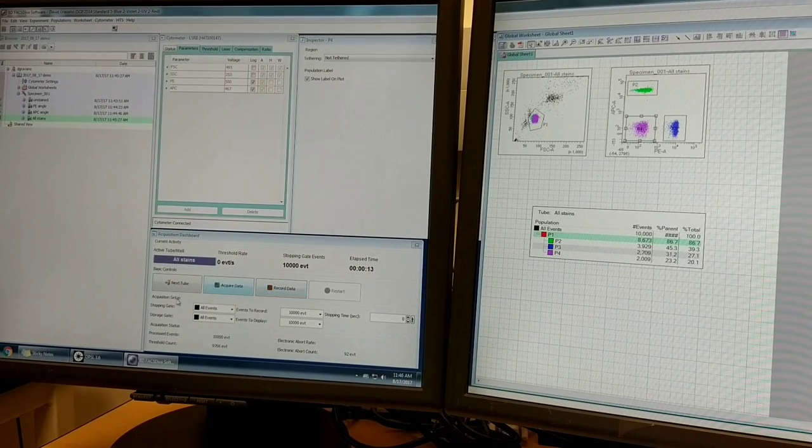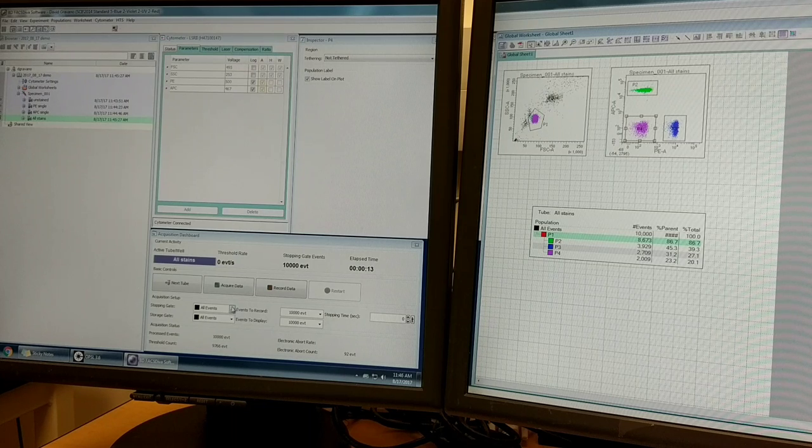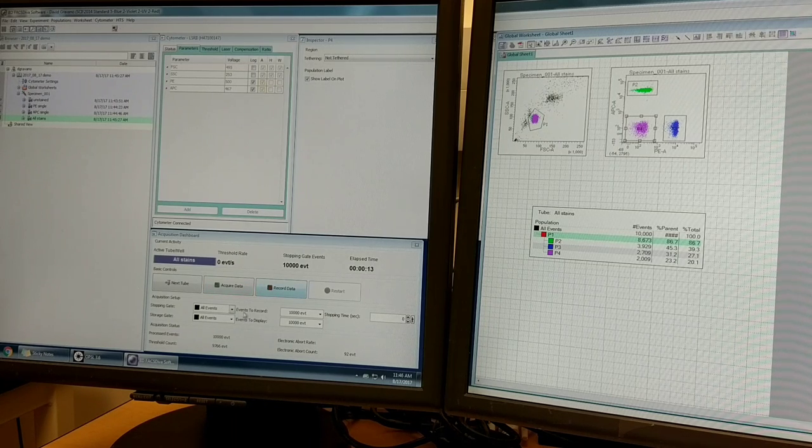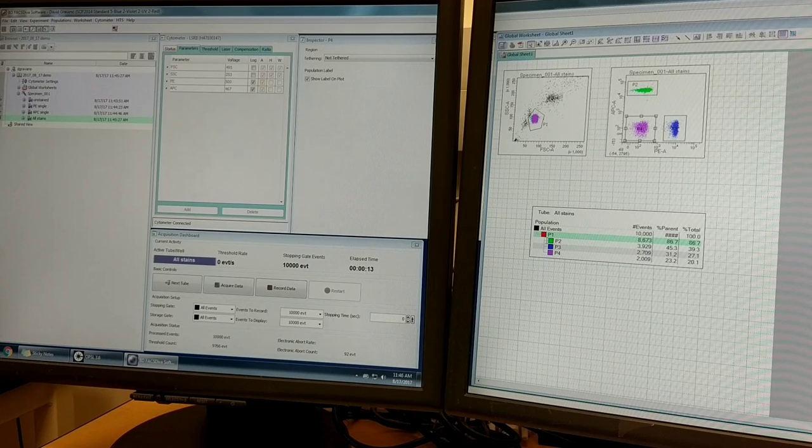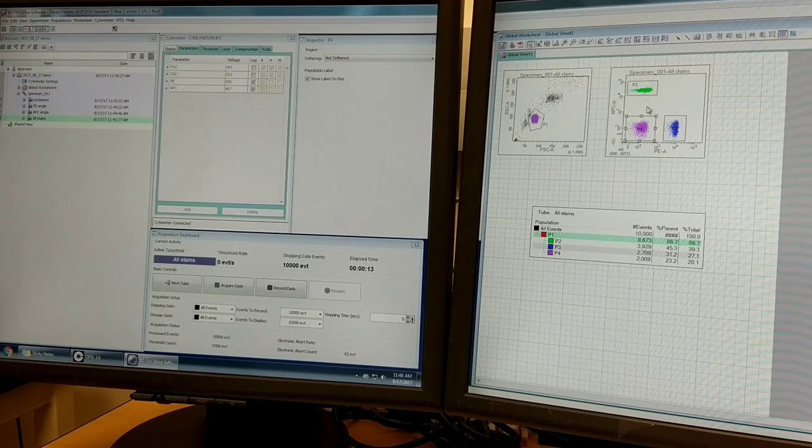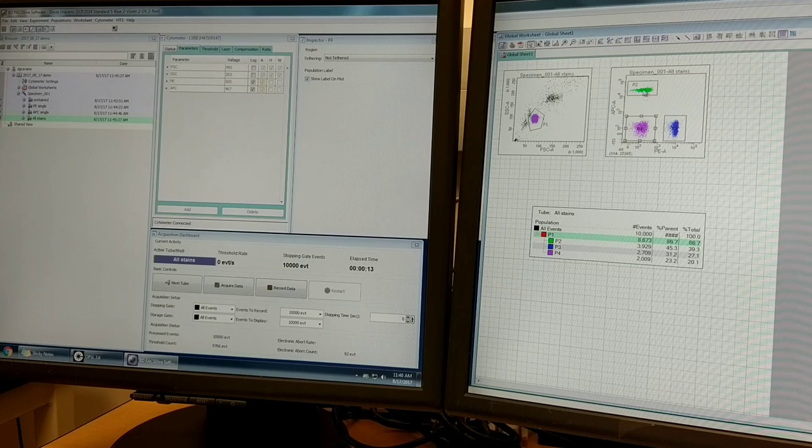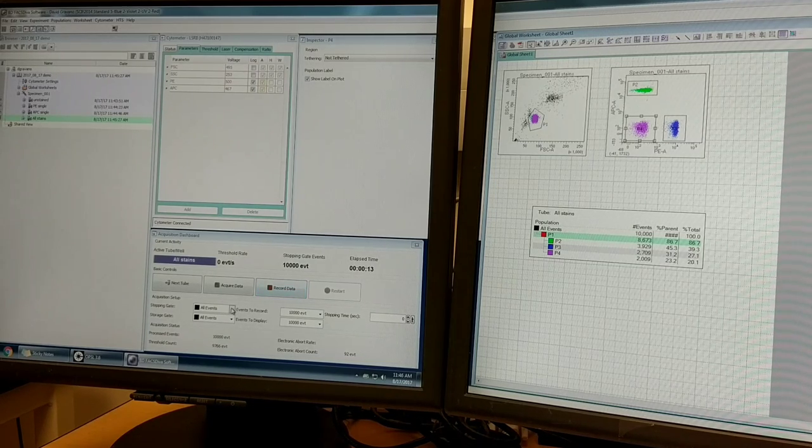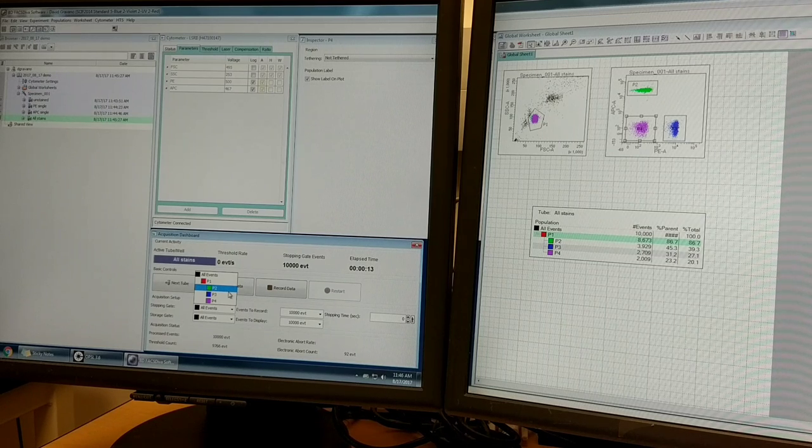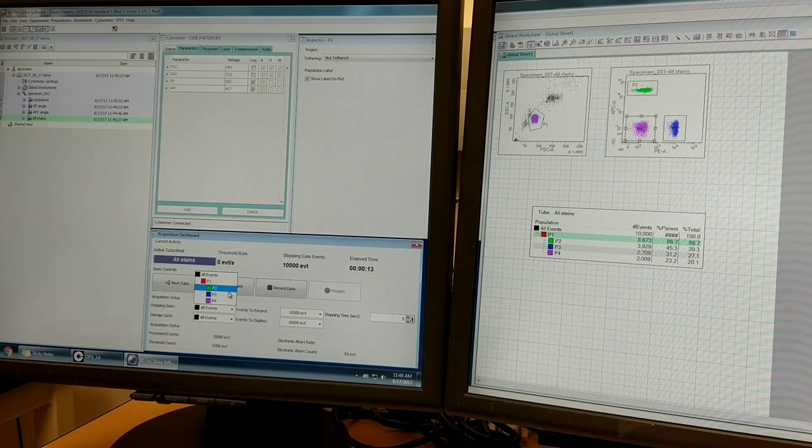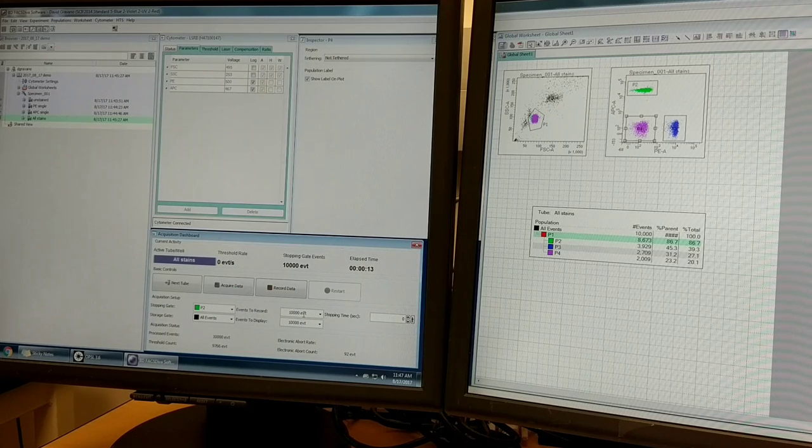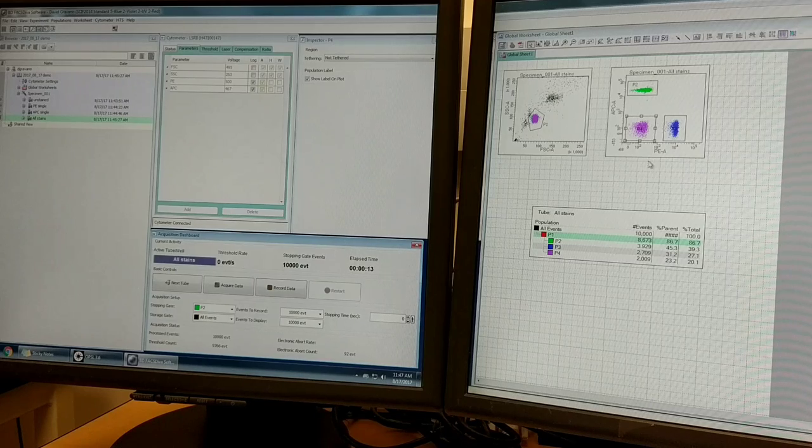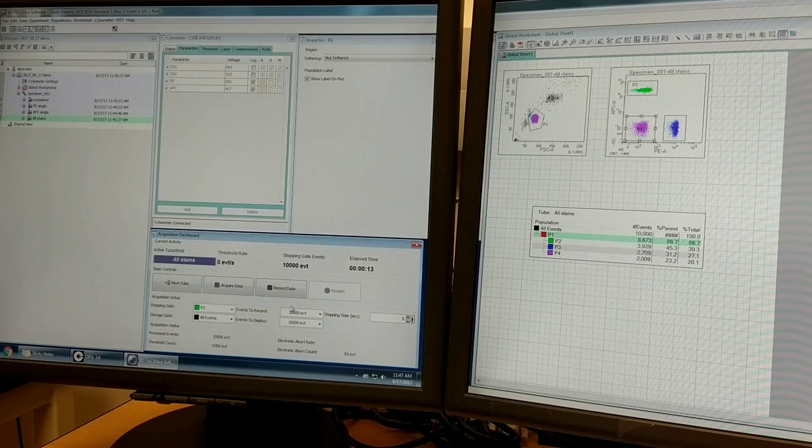I'm going to return to this stopping gate and storage gate. So stopping gate, we had initially selected 10,000 of all events. If, for example, you wanted to record 10,000 - you knew exactly you want to record exactly 1,000 of the APC positive events - you could change this to P2. And now it will keep recording data until you get to 10,000 of the P2 gate. So all in all, it will record about a little over 20,000 events if you do this.